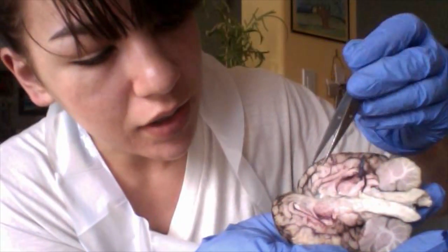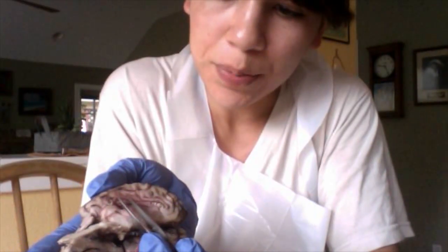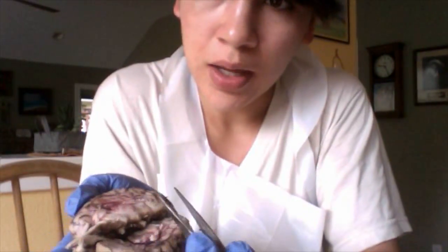The corpus callosum is this mass that runs here, and this is the object that connects the right and left hemispheres. I have the fornix at the anterior end of the corpus callosum. If I pull this down here, you're able to see into the lateral ventricle. That hole there is the lateral ventricle.